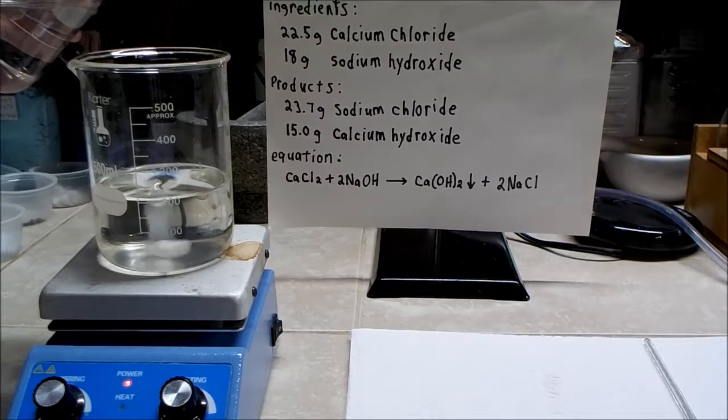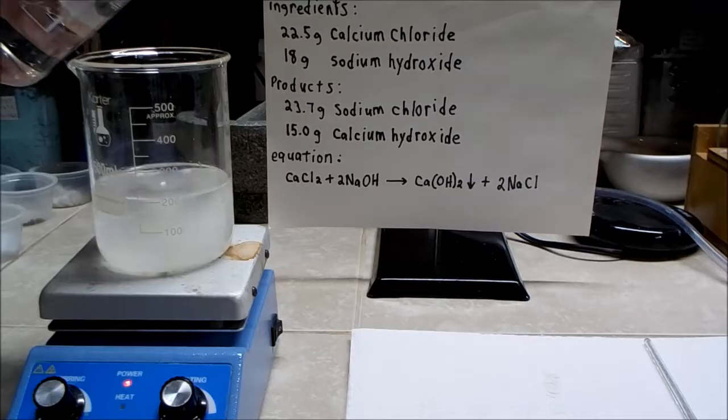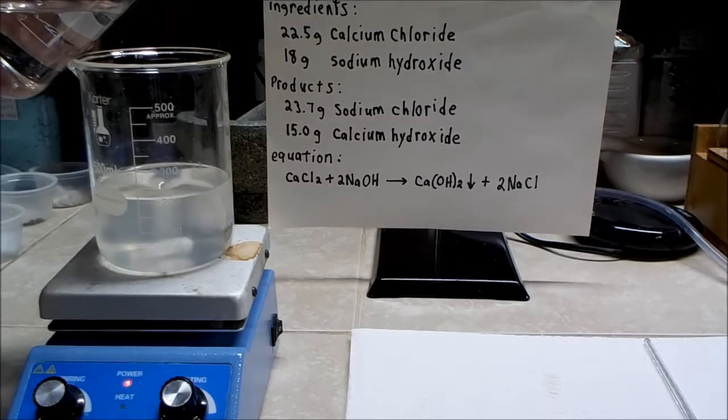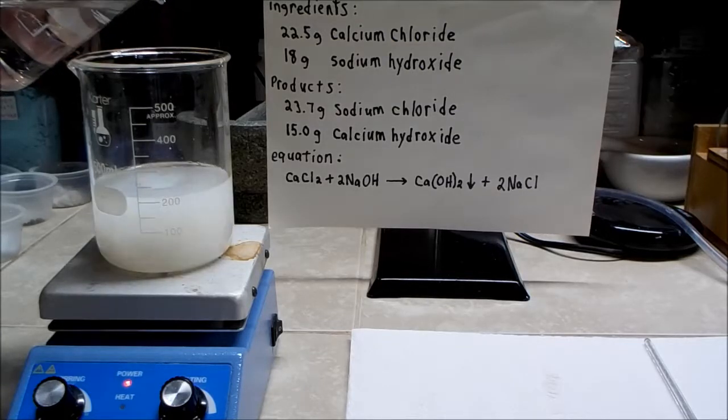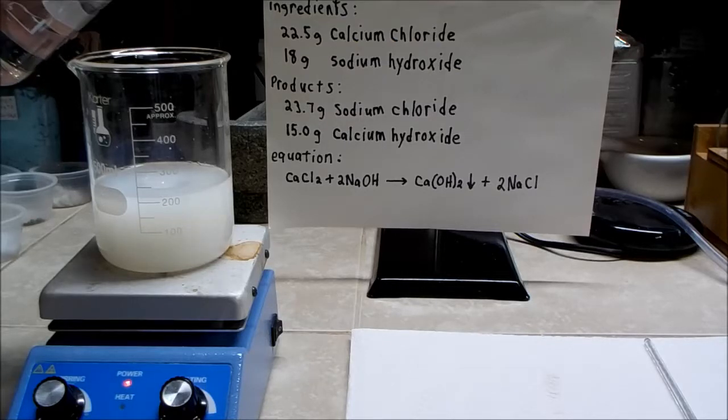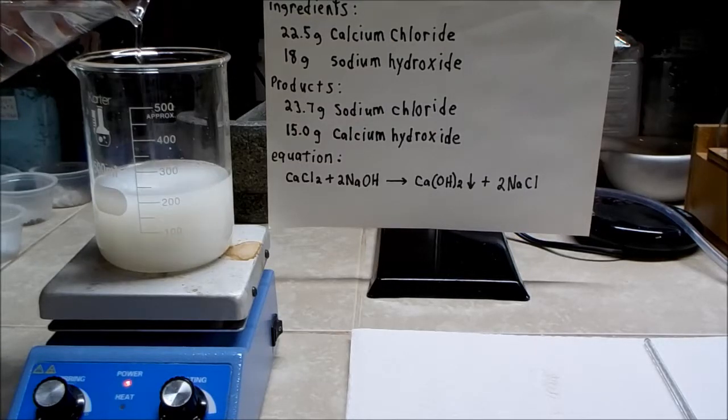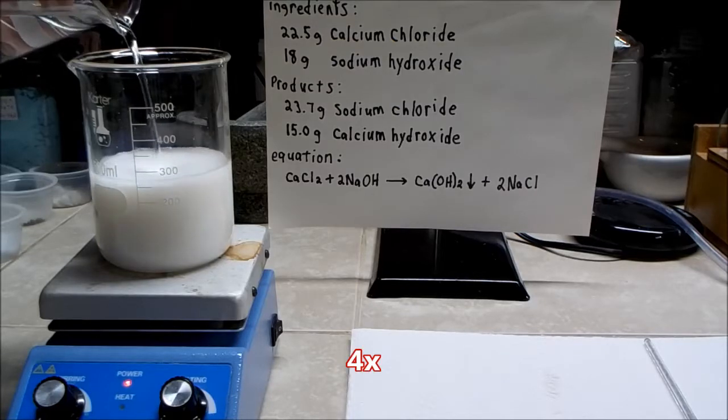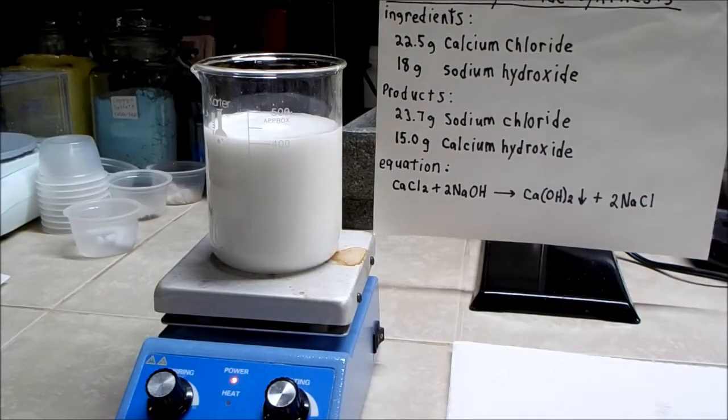Interesting, precipitate then it redissolved. It's probably a pH effect. As soon as it becomes alkaline enough, the precipitate will drop out, I hope. So I'll grab a pH paper and get a reading on that.